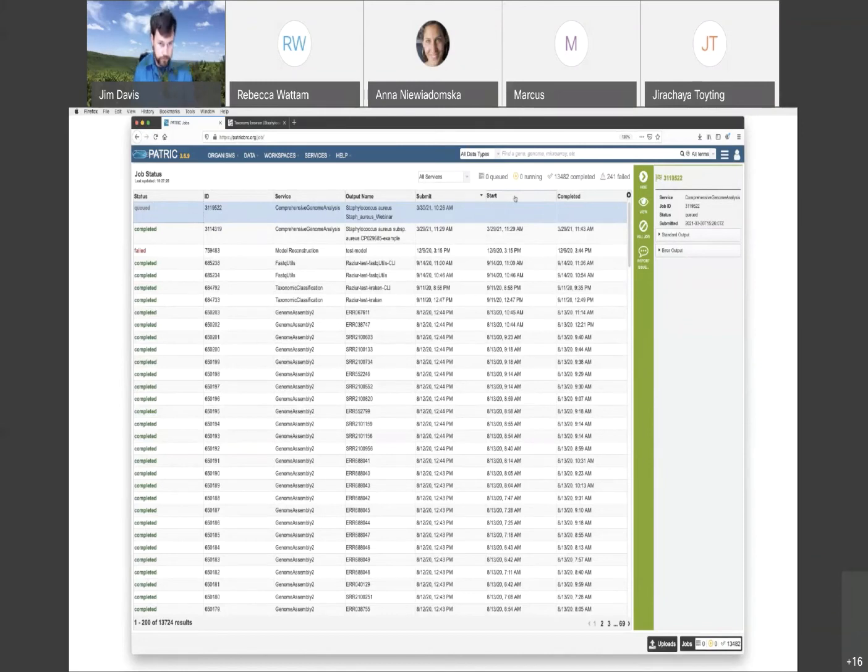So, for example, if you're assembling 1,000 genomes on here, and then you add the 1,001st genome, your priority will be lower than someone who's just trying to annotate a genome. So what it tries to do is balance the load from the heavy users with the load from the light users to create a fair environment.